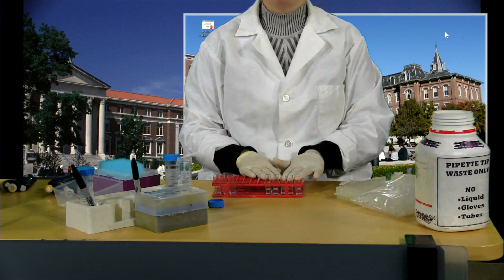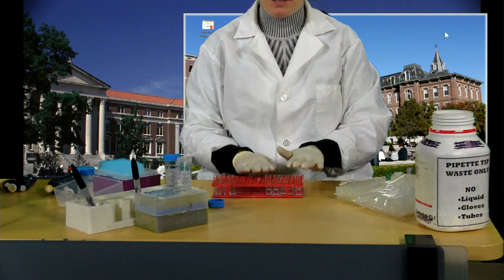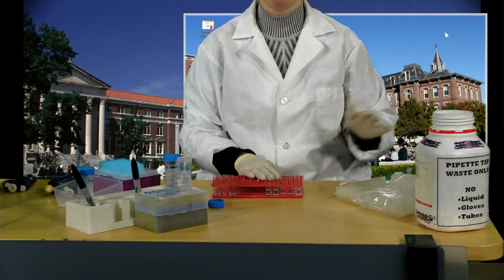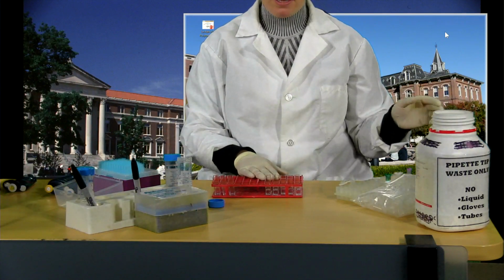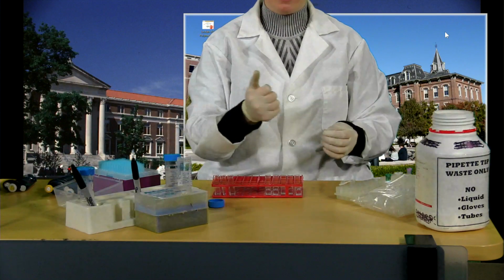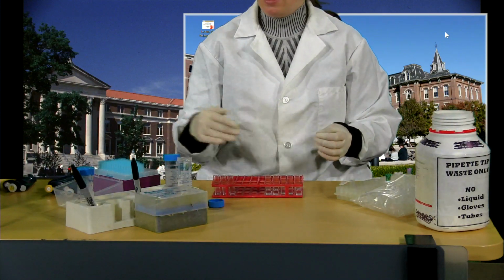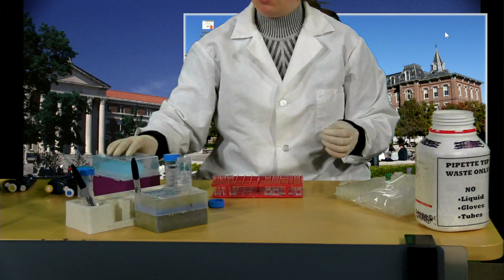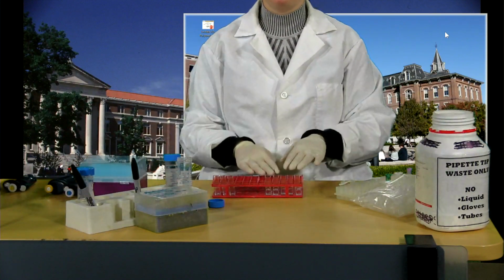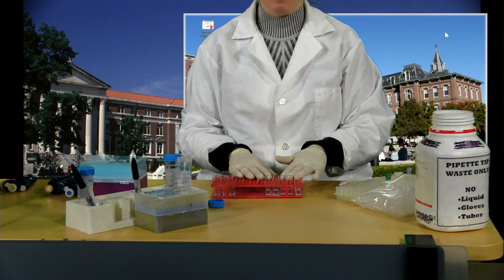Setting these up ahead of time, and if you're concerned, you can set these up even before you set your assays up, means that once my 5 minutes is up with my samples, I can just bring those back over here, and I'm going to pipette the entire reaction out of those tubes and into these, and it will be stopped immediately. The product then, p-nitrophenol, is going to be stable for some time. You don't need to rush to get the samples specced.